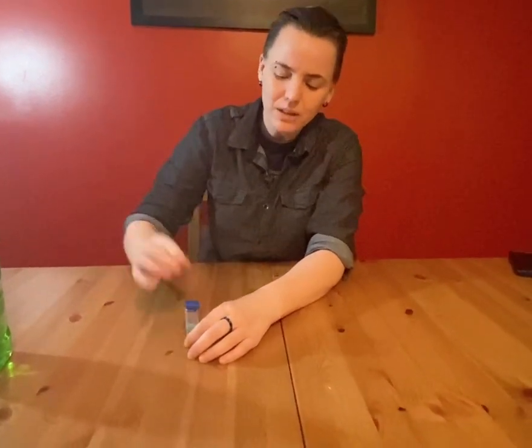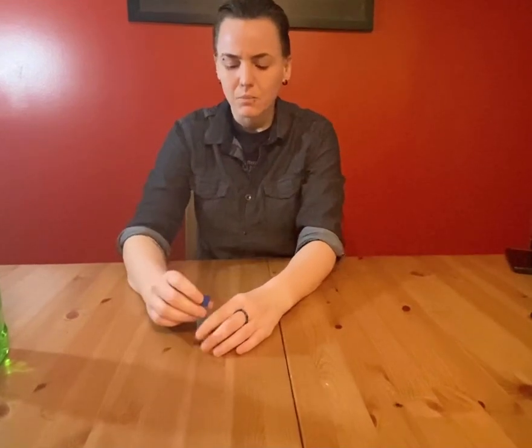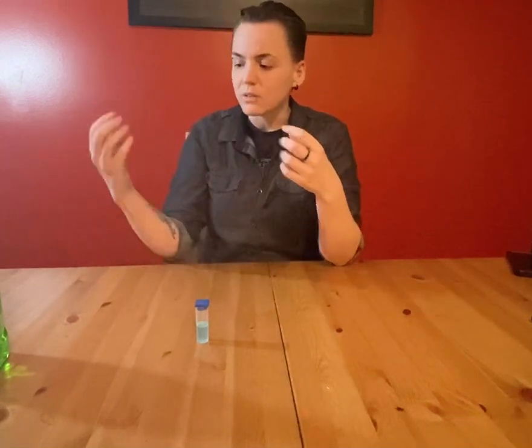So remember, in our lab last week, we learned that cells have a semi-permeable membrane. Well, that semi-permeable membrane is made up of something called lipids, which are essentially fats. So dish detergent basically dissolves fat. That's why it works. That's why when you put dish detergent in water, it foams and you're able to clean dishes well, because it dissolves fat.